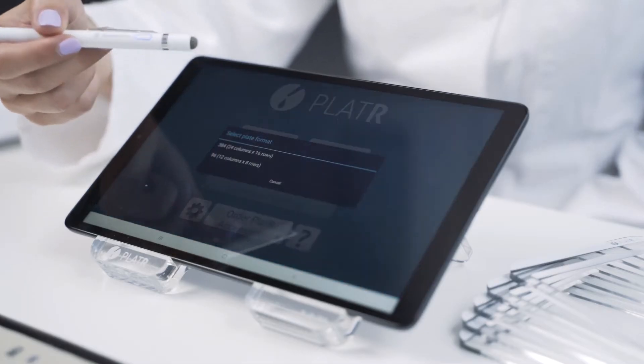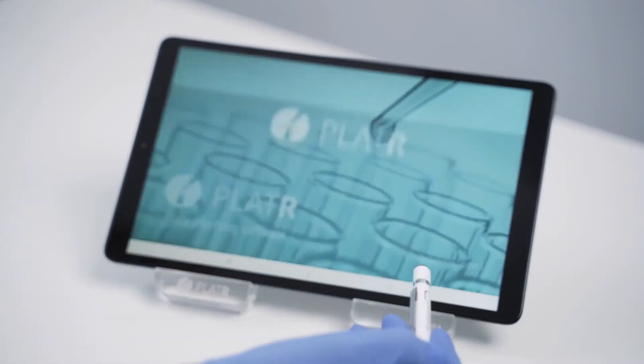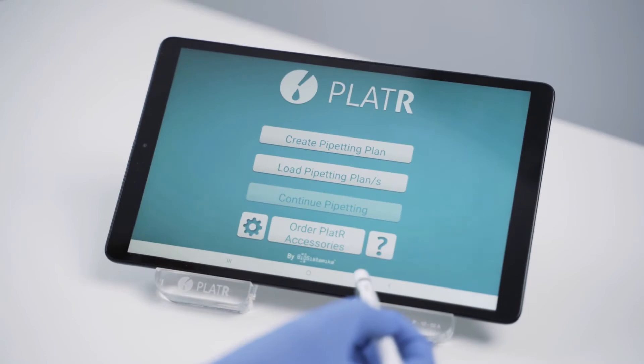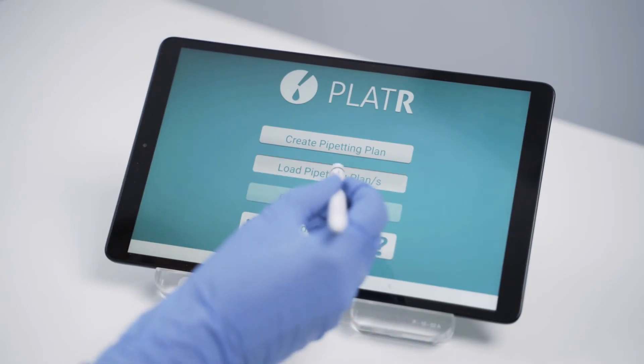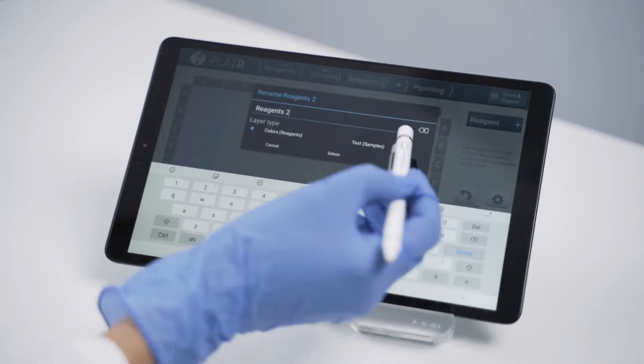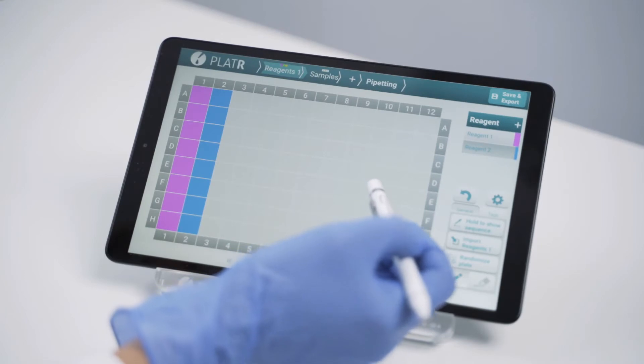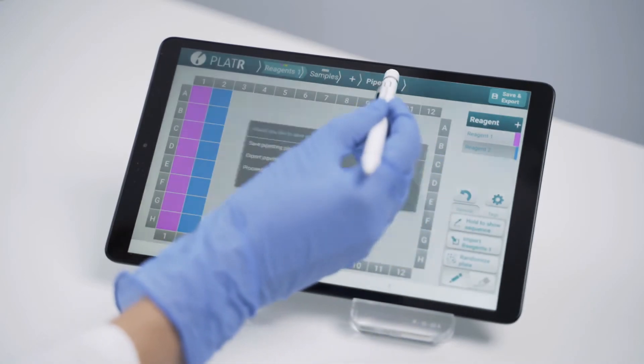In the previous video, we showed you how to create your pipetting protocol. This time, we'll simply upload an existing protocol. You can also change your protocol if needed. Make sure to save the new protocol before you proceed to pipetting.